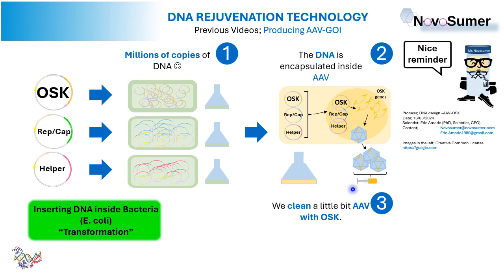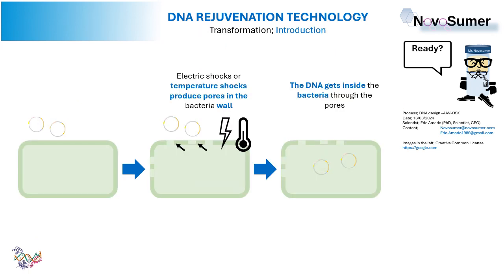Well, as mentioned before, today's topic is the transformation. In other words, inserting DNA inside bacteria. Let's start, shall we? Let's go for the next slides. Well, here we are in today's topic finally, inserting DNA inside bacteria, a process that is called transformation. And we start with a little introduction. It is an easy concept to grasp.